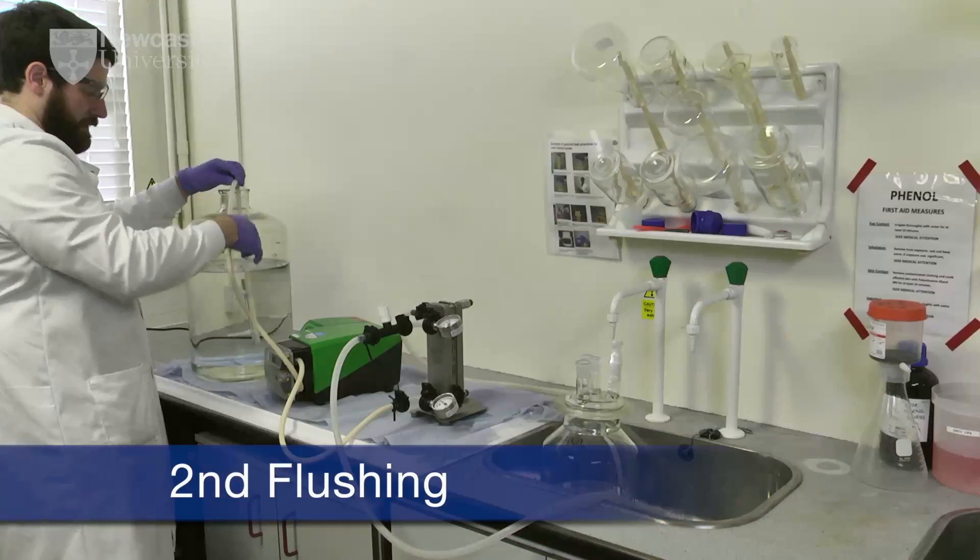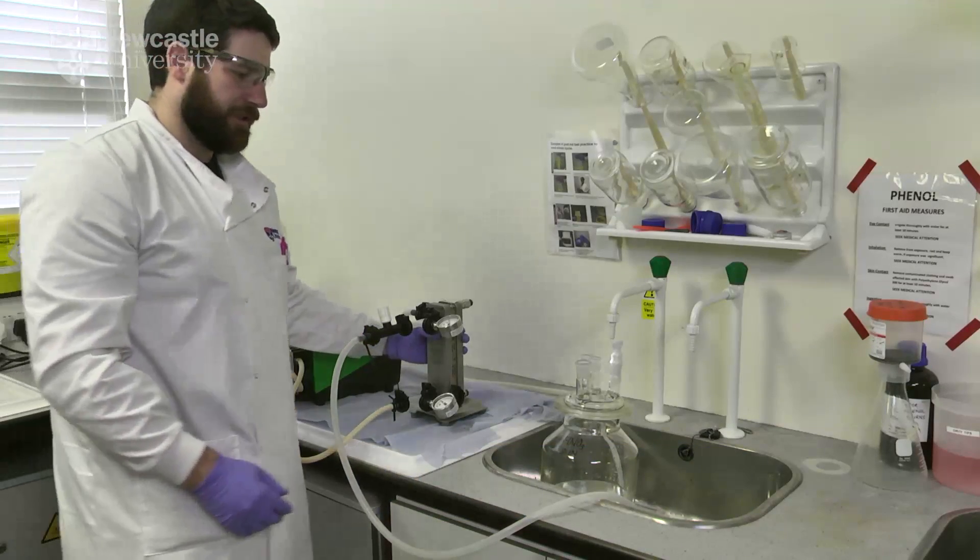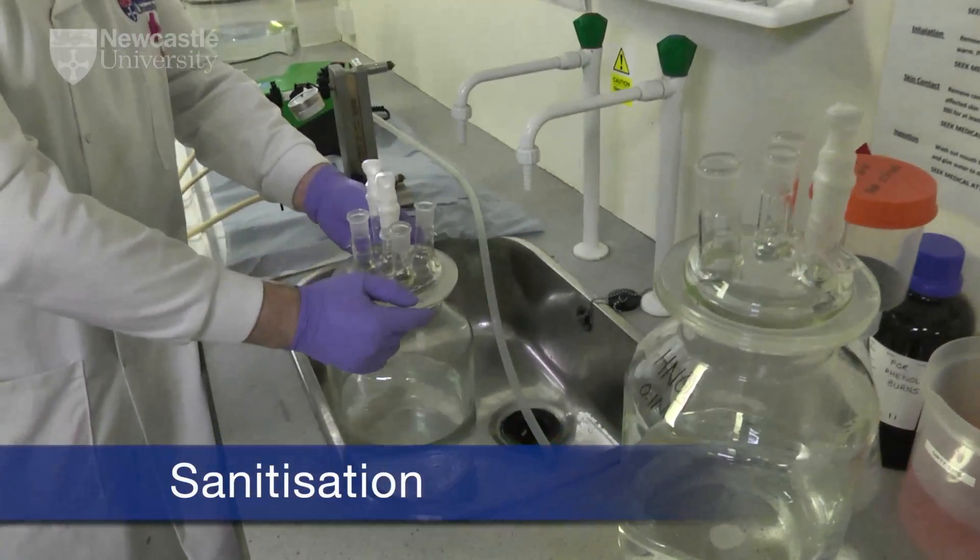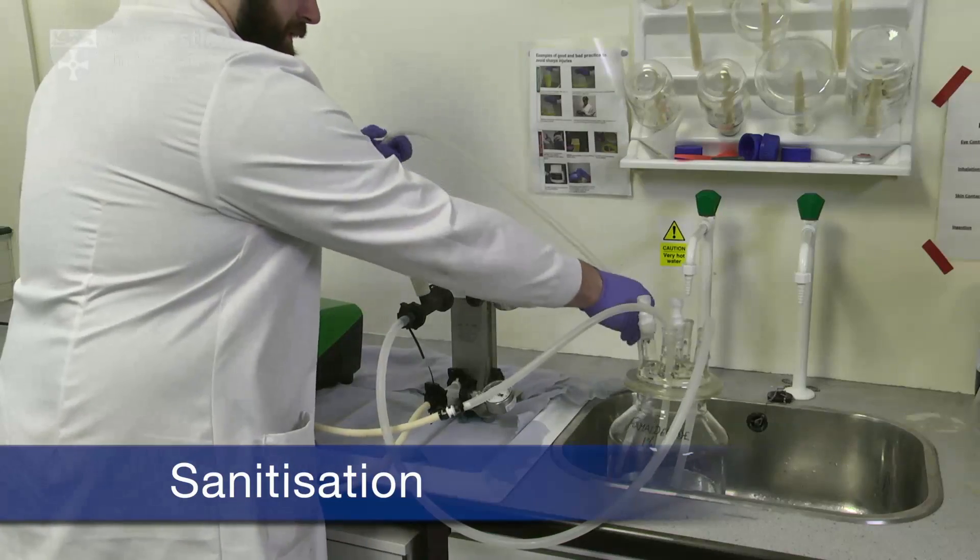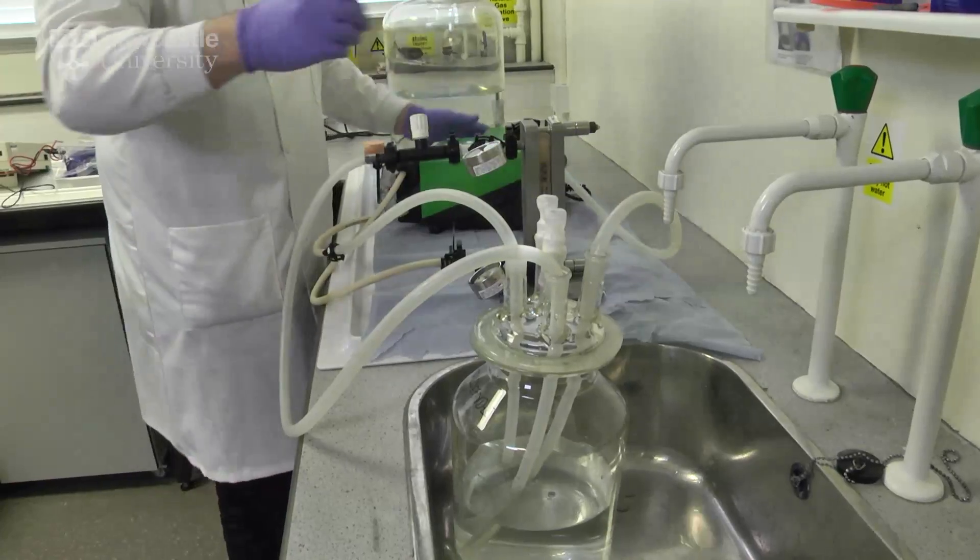The flushing procedure is repeated as previously described. A sanitising solution is then recirculated for approximately 30 minutes. The feed, retentate and permeate lines are all fed into the storage tank.